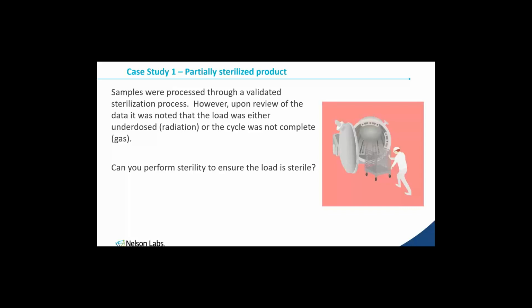But the key here is, can I just do some sterility testing on product from that load and show that it's still sterile? Well, we have to demonstrate that SAL, and that's going to be a 10 to the minus 6. Chances are, unless it's a high volume product, such as an adhesive bandage or swabs or something like that, I don't have 1 million products. And then also with that, I don't have 2.5 years for those 1 million products to be tested by the laboratory to release that batch. So if there's an issue like this, sterility testing really isn't the answer.